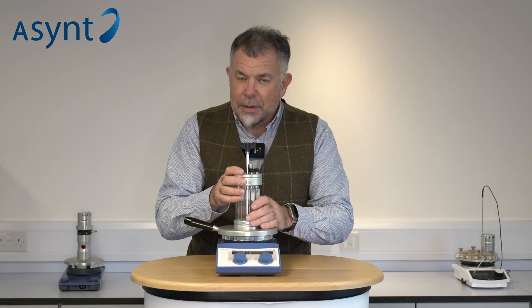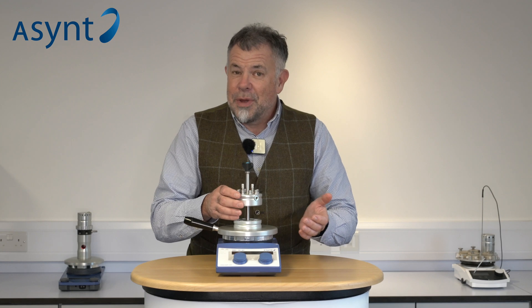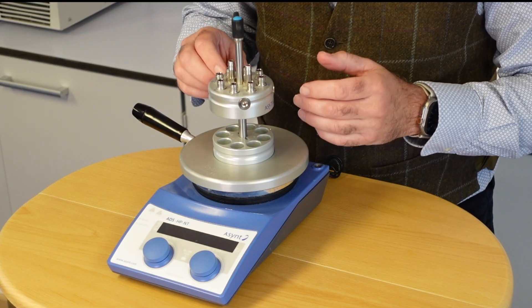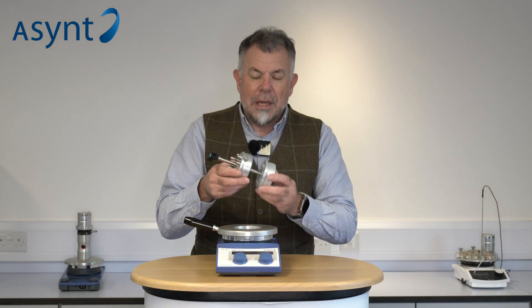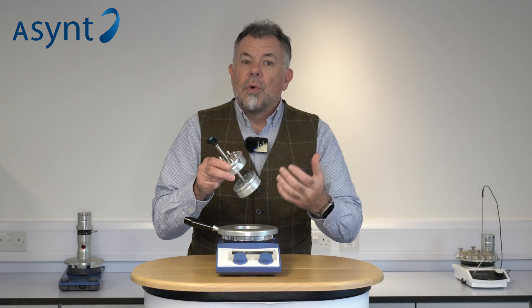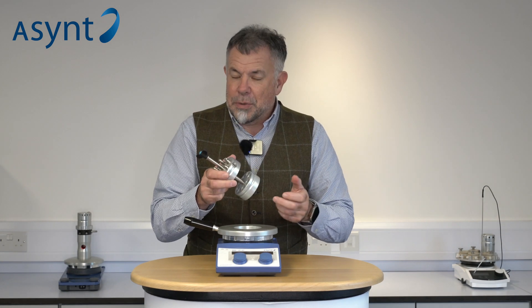So that's a great little product, but let me show you where this leads on to. To enable customers to work with standard syringe needles and be able to get samples right from the bottom of the tube, we've made a shorter version. It's exactly the same product but with a shorter rod, or you could just swap the rods — they're very, very easy to adapt between the two.